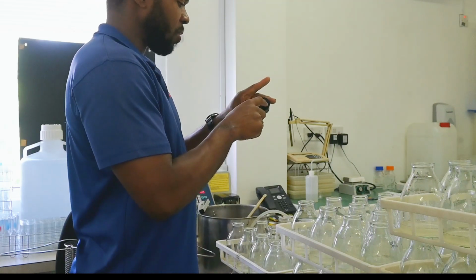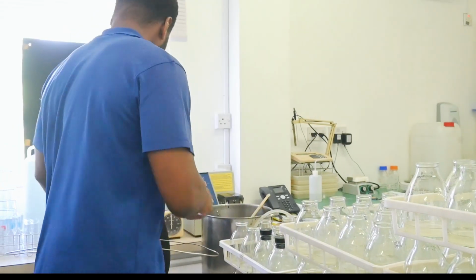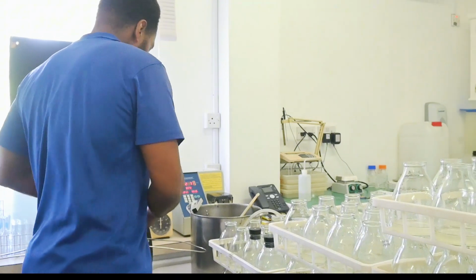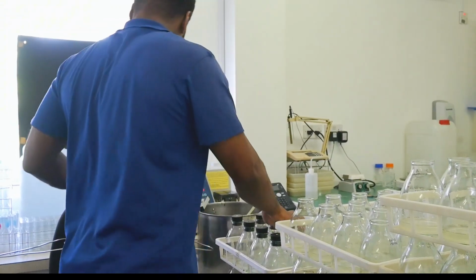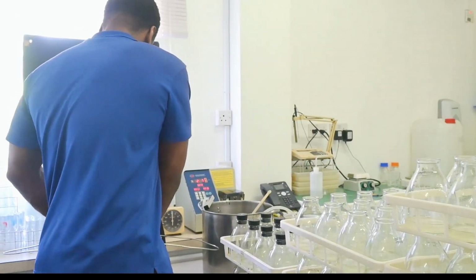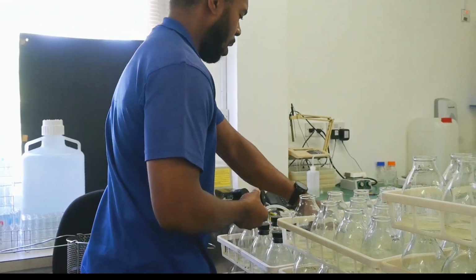So that's the point of the cotton, and we just cover all of these and press it firmly, because if the covers are not placed firmly enough, the heat and the pressure from the autoclave will cause the corks to come out.